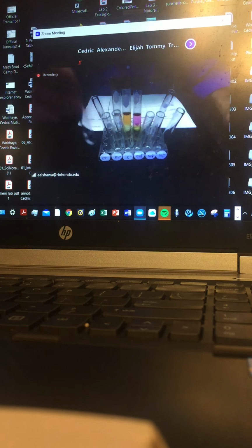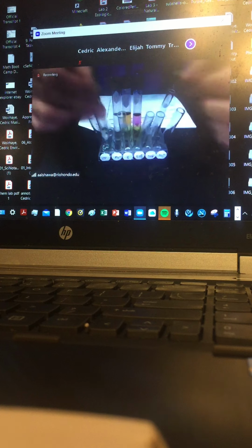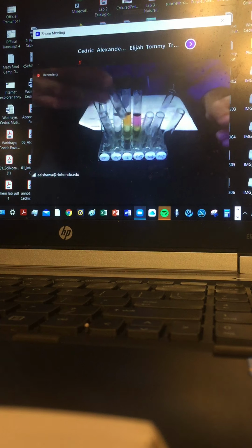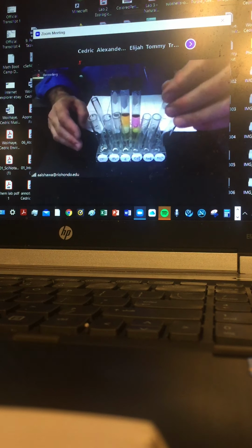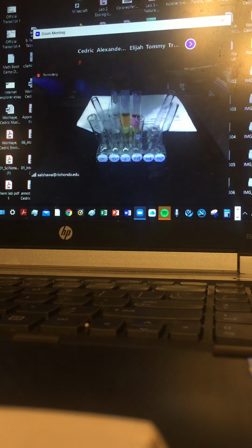Okay, so that's the color of it. I want to add chlorine to the bromide. Make sure you mix them and make sure they're mixed. So that's the color. And I want to add chlorine water to the iodide. All right, so the other ones, chlorine water. Let's see my chlorine water. Okay, so this is the outcome.